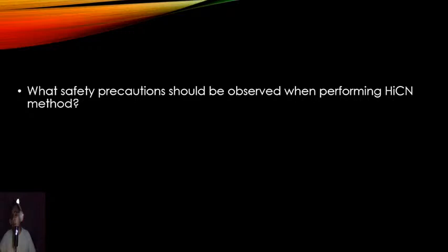All right. So we're delving into laboratory management and safety. It's always important for you guys to remember this one also, because if you are a person who has prospects to work in the United Kingdom or the United States, safety precaution is one of the most important things that you need to remember when you're doing tests associated with hemoglobin or hemiglobincyanide methodology.